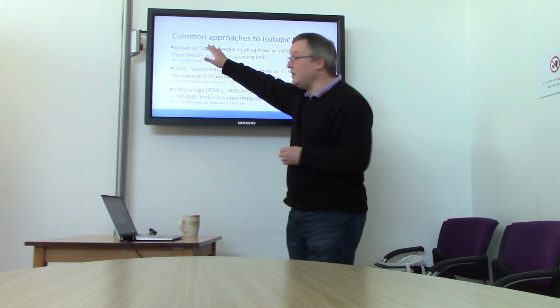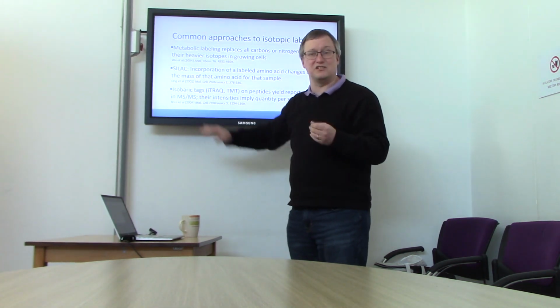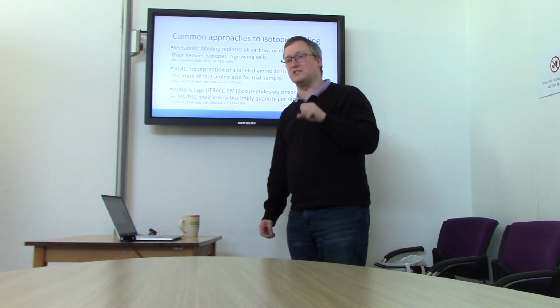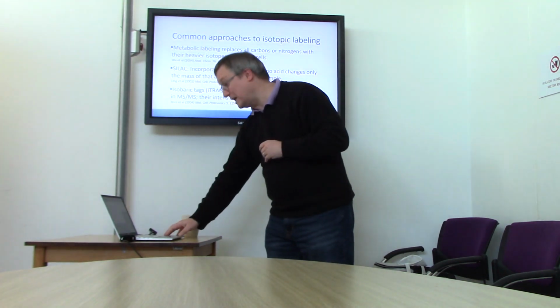So there's a long history of labeling our samples with heavy isotopes in order to make it possible to compare the intensity attributable to one sample to the intensity attributable to another. Okay, so this is labeled quantitation.